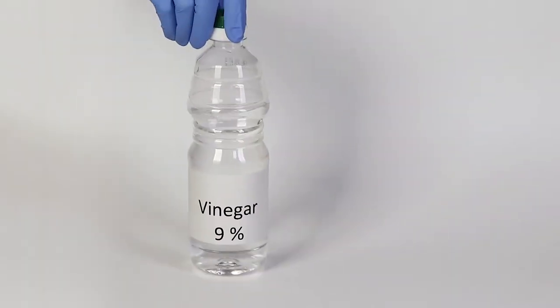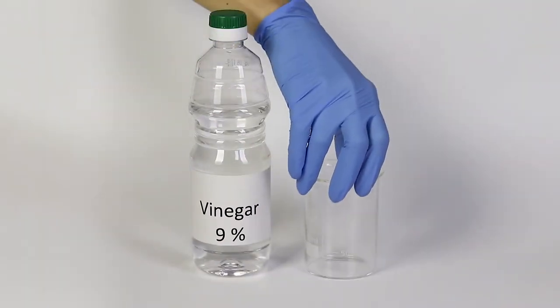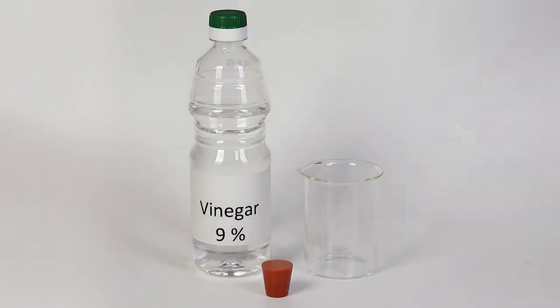For the rubber egg experiment, you will need a 5 to 10% vinegar solution, a beaker, a rubber stopper, and an egg.